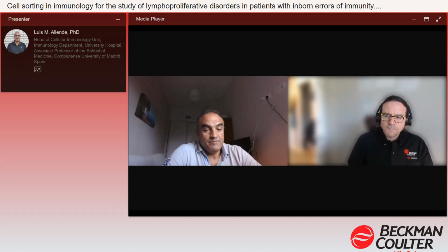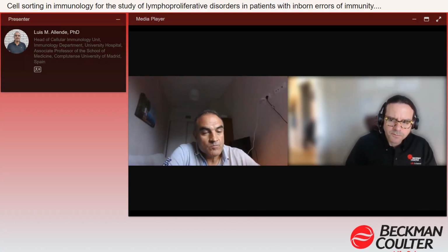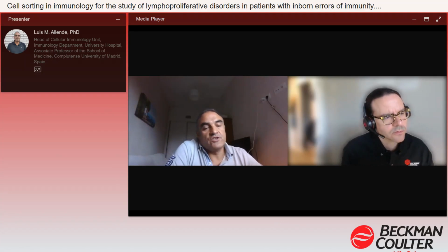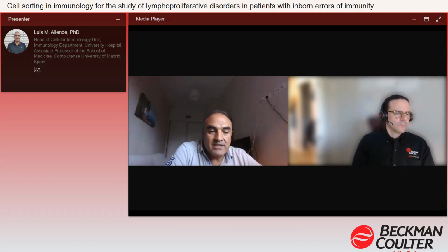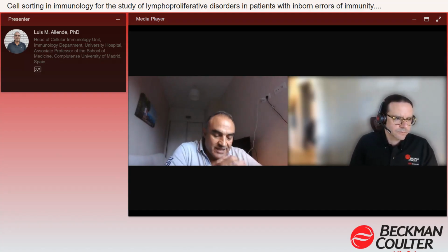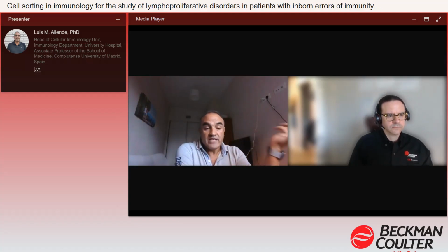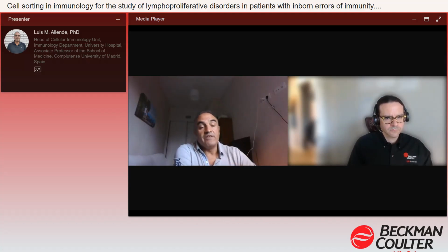Okay, thank you. I saw a question come in. You have a few different pieces of hardware in your lab as far as flow cytometers. Do you find you can use the same sample from your other flow-based tests for sorting, or do you prepare a sample only for sorting and only for analysis? Normally, we use the sorting only for sorting of cells, but we have an exception. For example, sometimes we use the sample for diagnosis and research at the same time. This is the case of ALPS patients, where the same preparations can be used for the counting of DNT cells and for isolation of these cells.